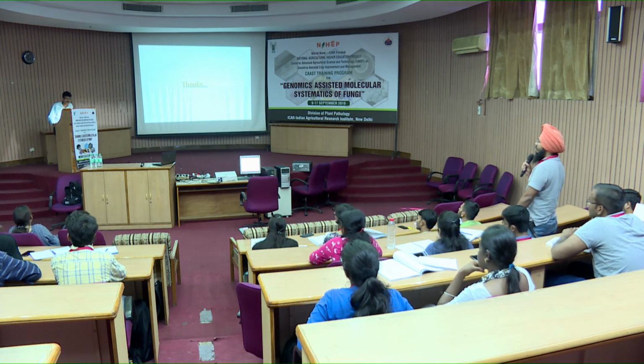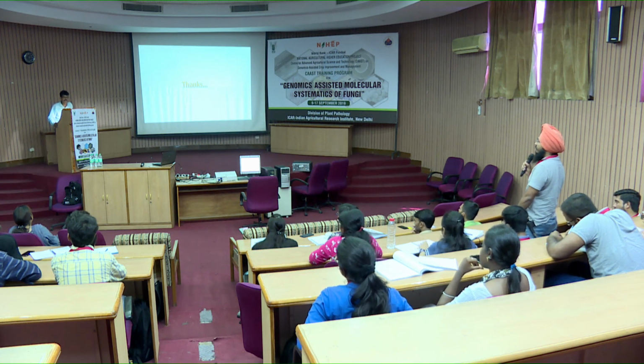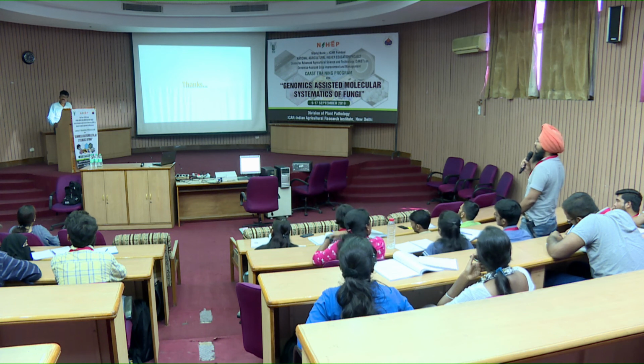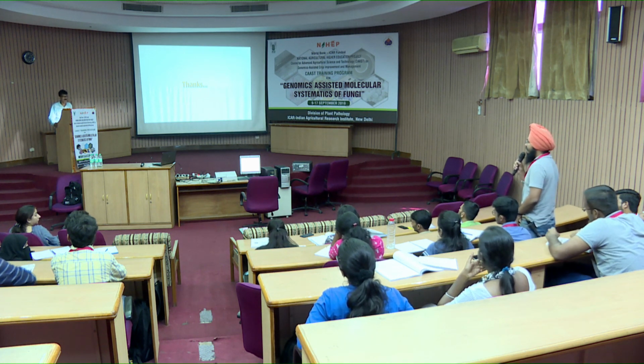All 3 should work technically, but in our own experience, the cloned one does a better job than the other 2. The size of base pair, we will take the size of amplicon, not the size of complete gene. No, okay, size of amplicon, yeah, of course. Yeah, it's the size of amplicon only, yes.